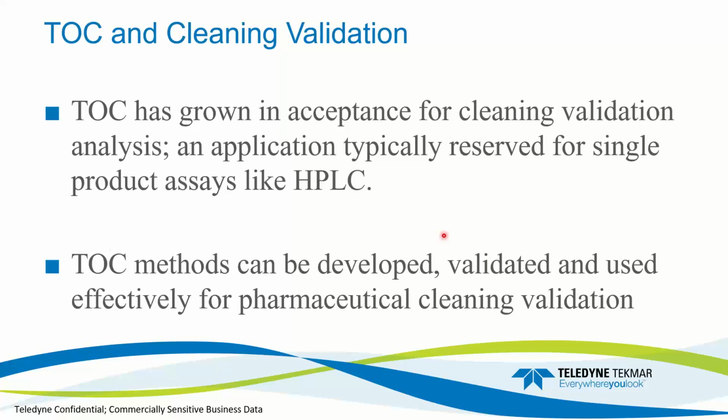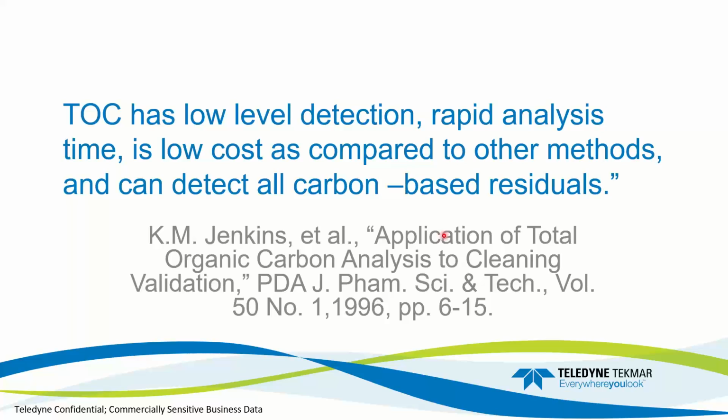So TOC has grown in acceptance for cleaning validation analysis. An application is typically reserved for a single product assay like HPLC, but the methods can be developed, validated, and used efficiently in pharmaceutical cleaning validations. And over time, there's been a lot of great publications.